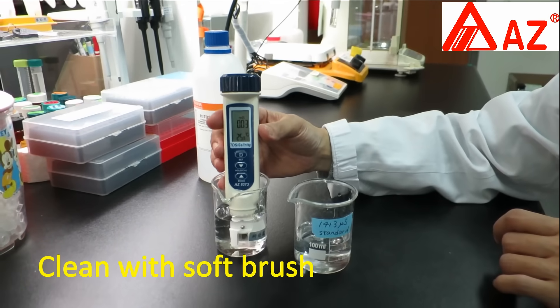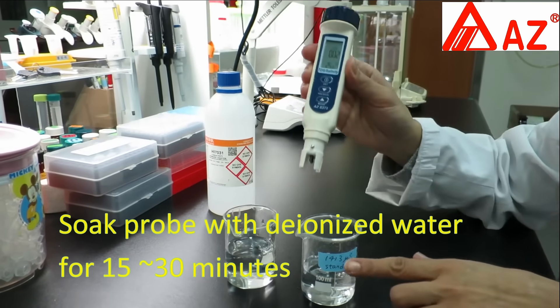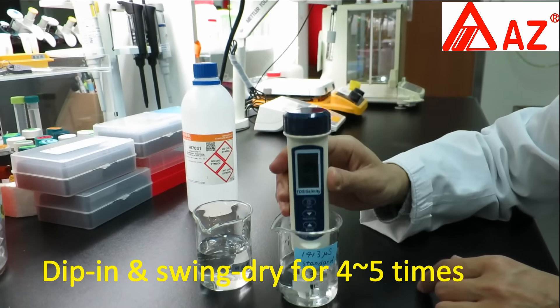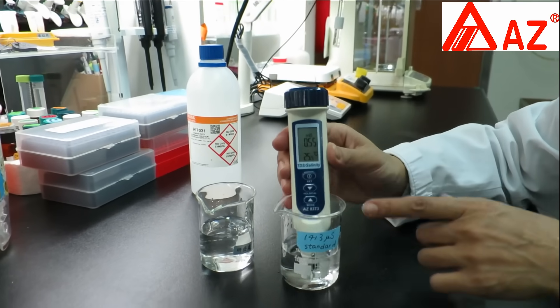You can clean the electrode with a soft brush. Soak the probe in deionized water for about 15 minutes to stabilize and clean. Repeat 4-5 times: dip in solution and swing dry. This can remove air bubbles from the sensing area.